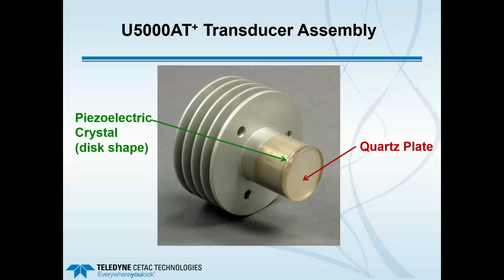And as the vibrations are coupled from the piezoelectric crystal through the quartz, the aerosol is then generated. Again, the argon nebulizer gas supply from the host ICP would only be used to carry or sweep that through the ultrasonic nebulizer and then to the ICP. That gas flow in this case does not generate the aerosol.